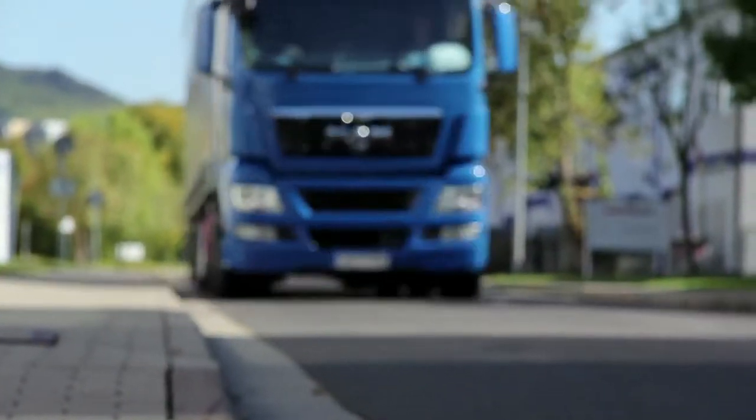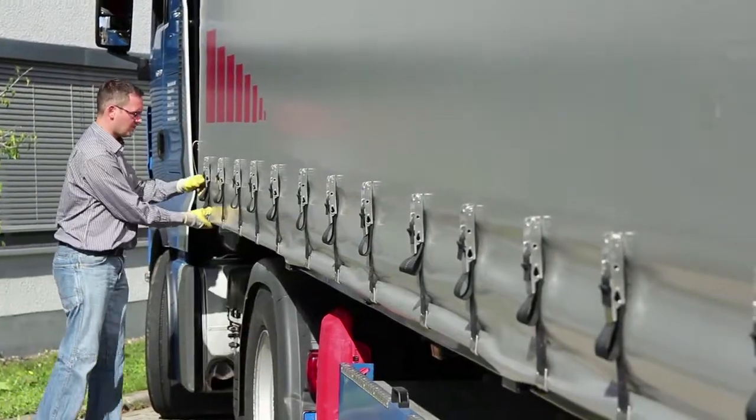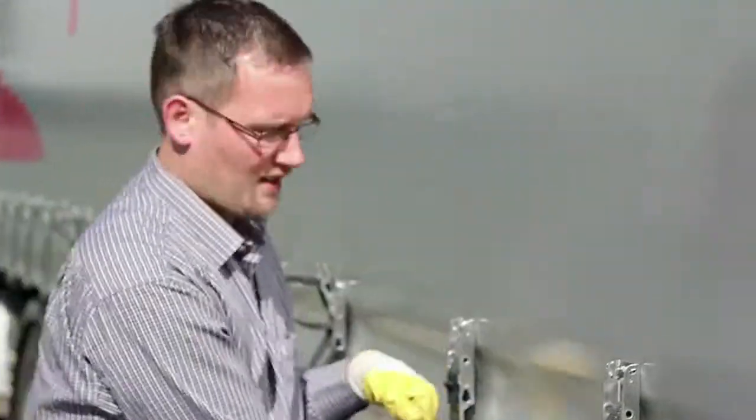Analytik Jena is a German innovative manufacturer of analytical instrumentation for versatile industrial and scientific applications in many sectors such as environment, food and agriculture, chemistry, petrochemistry and medicine.